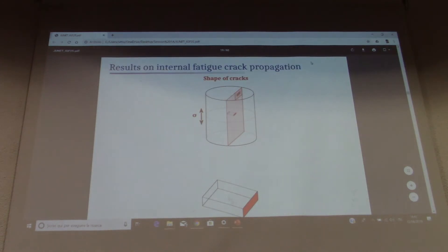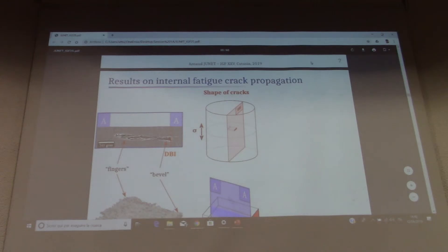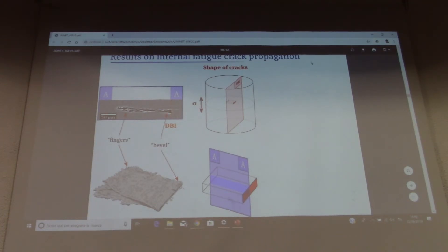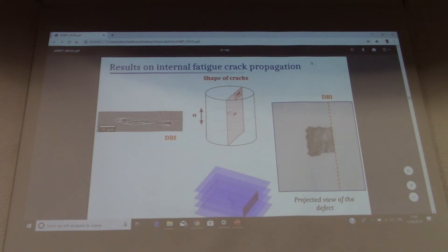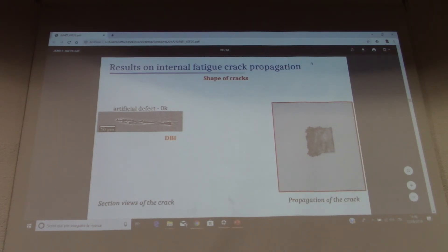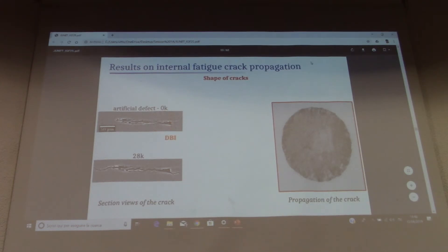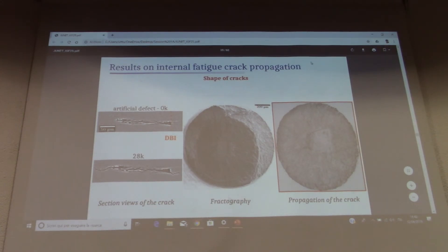Now I will present the results on internal crack propagation, starting with the shape of the cracks. Looking at the section view of the notch before testing, we can see a bevel shape at the diffusion-bonding interface and fingers away from this interface. In projected views along the applied stress axis, the notch has a square shape. After fatigue cycling, a crack initiates from the notch at the first cycles and grows globally in Mode I, with a very regular and circular front, ultimately causing failure of the specimen.